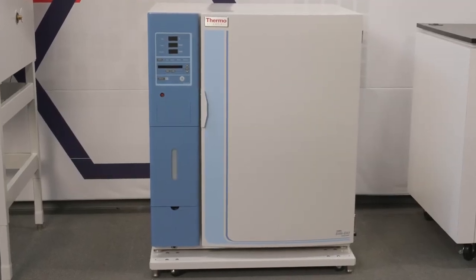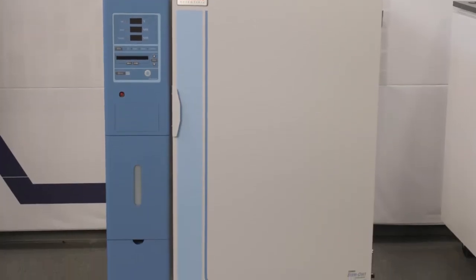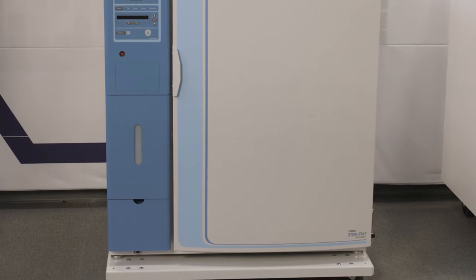The Thermoscientific Forma Stericult CO2 Incubator is a premier choice for use in a cell therapy setting. Learn how easy it is to clean and disinfect.